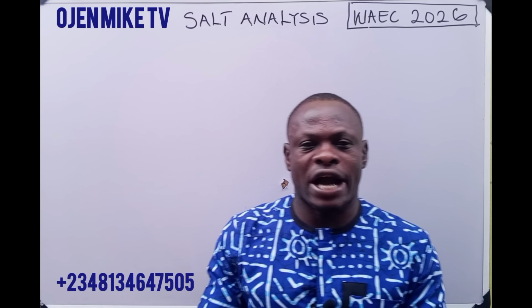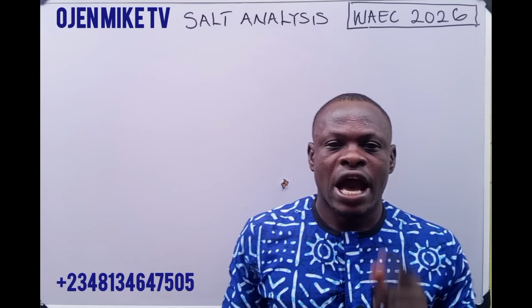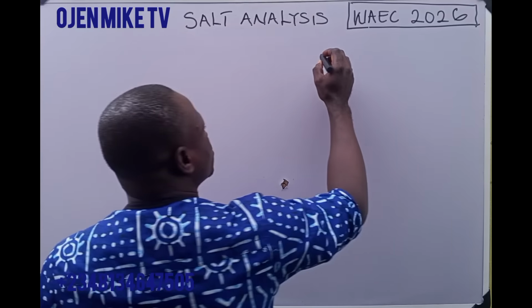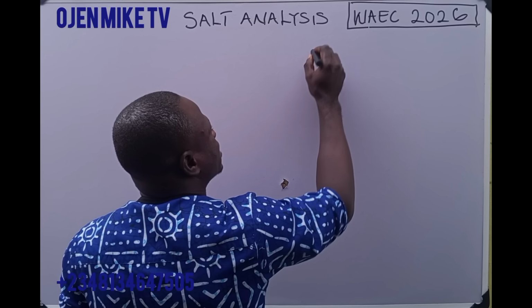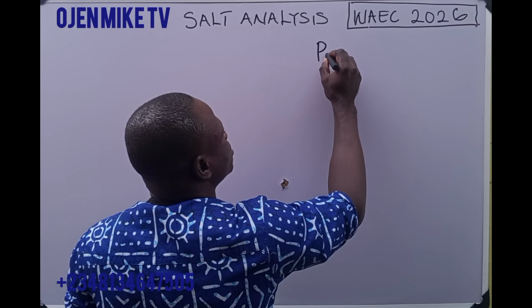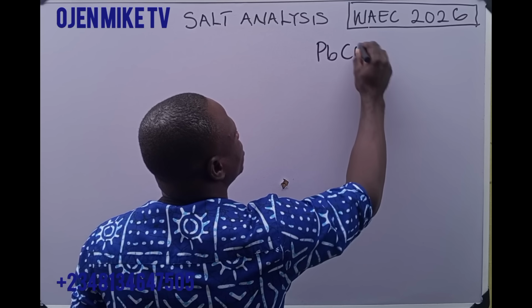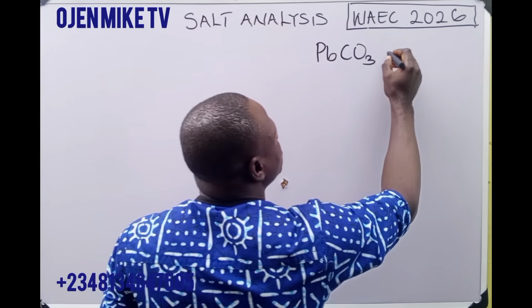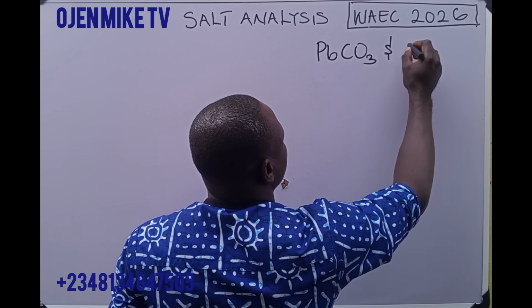Now today we are going to look at salt analysis. And now what is the thing that you have been given in that analysis? We are given starch and lead 2 carbonate. We are given this salt, lead 2 carbonate and starch.